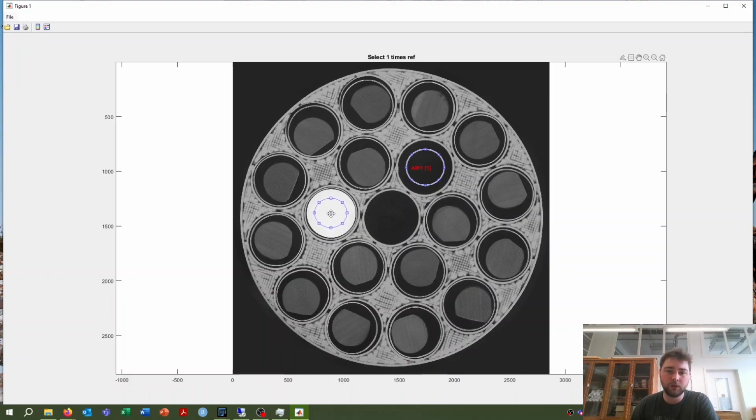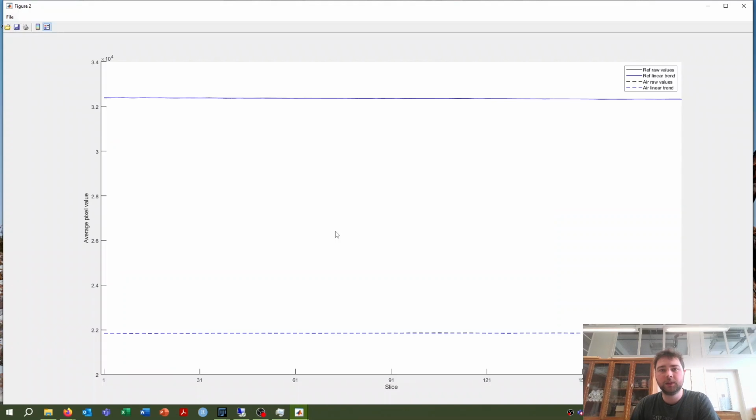And again, I just take nicely the middle and only the location where there's a POM. And I stay away from the edges just to be sure. Okay, and nicely in the middle. Double click, okay. Then it has to calculate a little bit, okay. And then it shows me what it looks like.